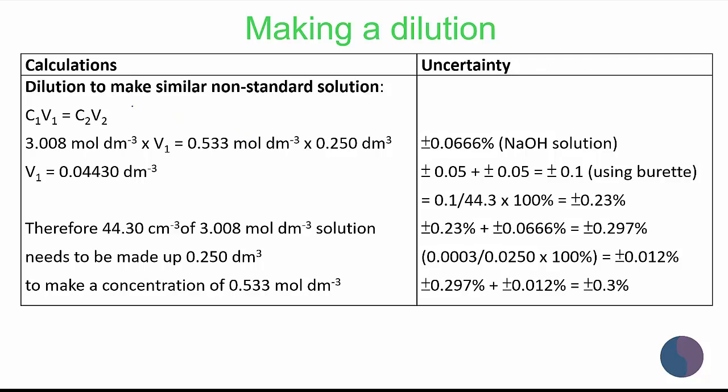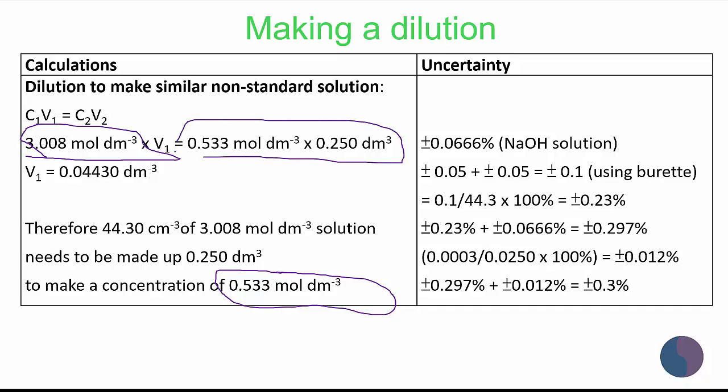So this lab's just for the sake of showing you how to do dilutions. I've already made up a standard solution of this concentration, and I'm trying to make up a solution of the first standard solution I made up in the first video. And so to do that, I have to decide I just want to make exactly what I made up from the previous video, which was 250 mils of a 0.533 molar solution.